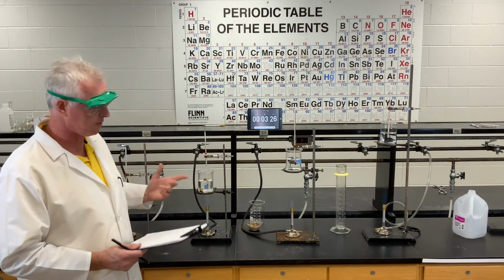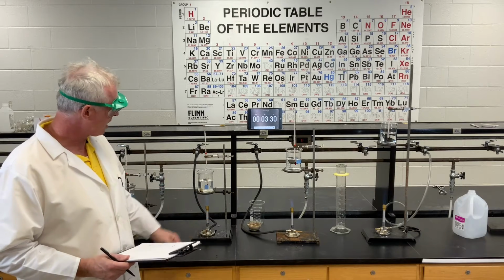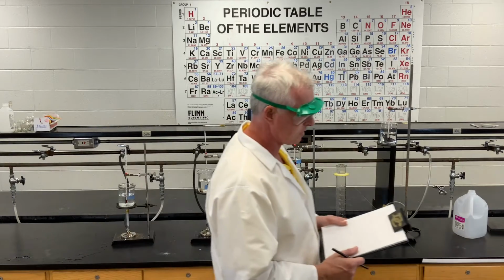The best height when you set up a burner to get the hottest flame is going to be at the top of the inner cone. We're going to let this go to see exactly how long it takes, and then we can discuss it again in a moment.